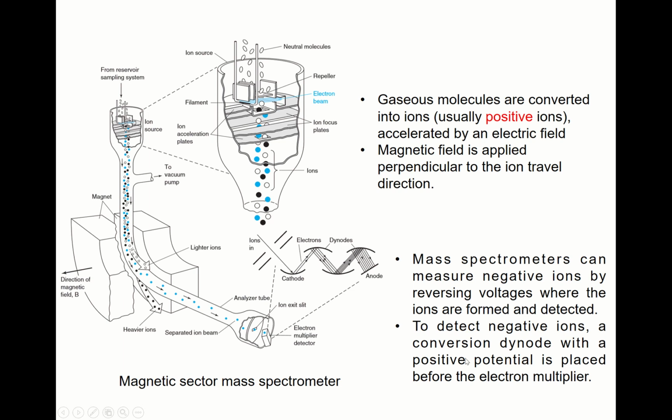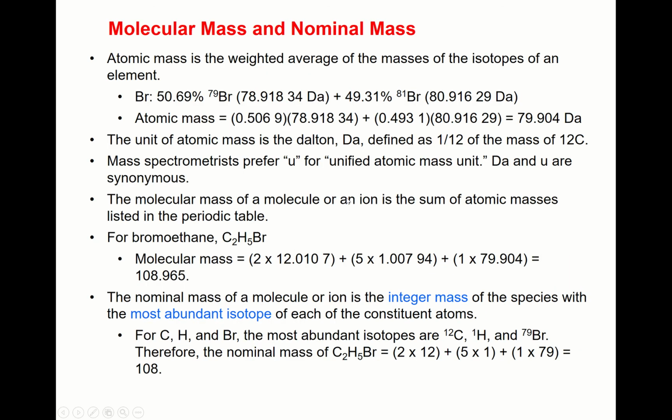Yeah, this is one of the mass spectrometers, okay. There are several different types of mass spectrometers, right? Okay, but before going into details, let's first distinguish molecular mass and nominal mass.